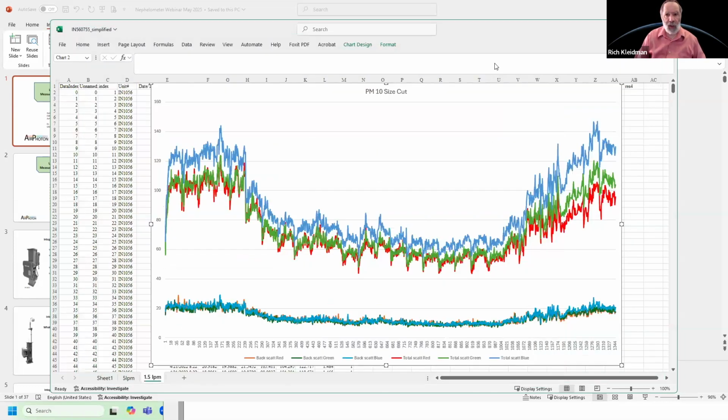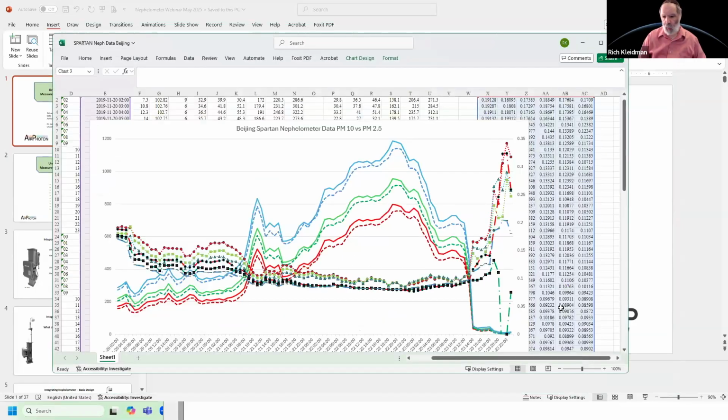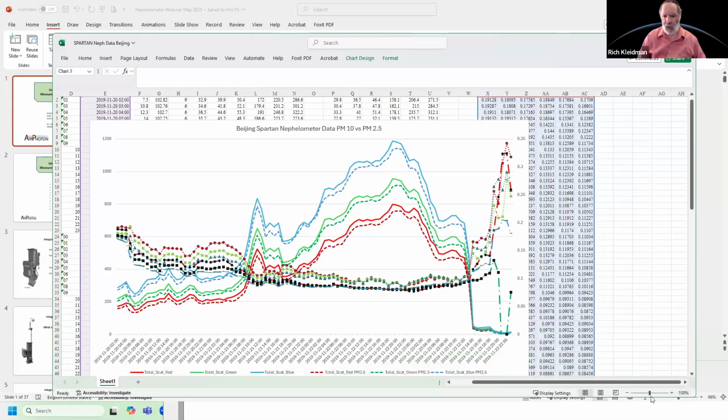And I wanted to show one last one. This is a very busy slide, so give me a minute. So the SPARTAN network operates approximately 30 instruments around the globe, including one of the people who is joining us. He operates one in Israel. So hi, Ellie.